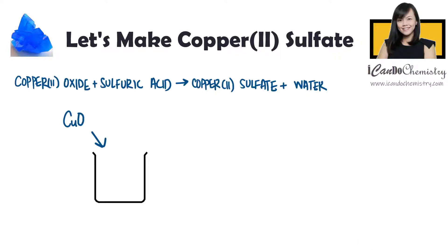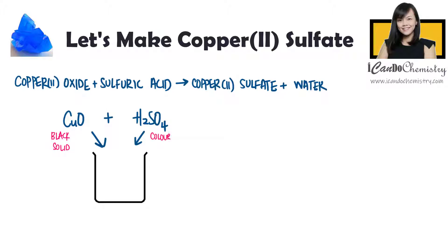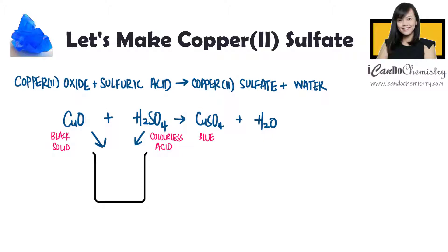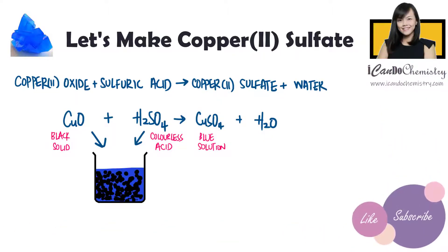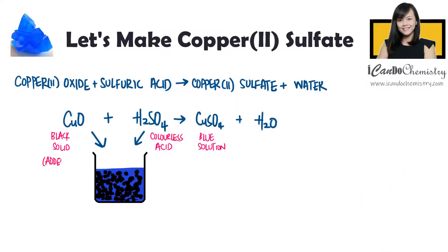Firstly, we will need to make copper-2-sulfate. There are different ways to obtain copper-2-sulfate. In this experiment, we will add copper-2-oxide into sulfuric acid. To ensure complete reaction, we will add copper-2-oxide until no more solid dissolves. The copper-2-oxide is said to be added in excess.